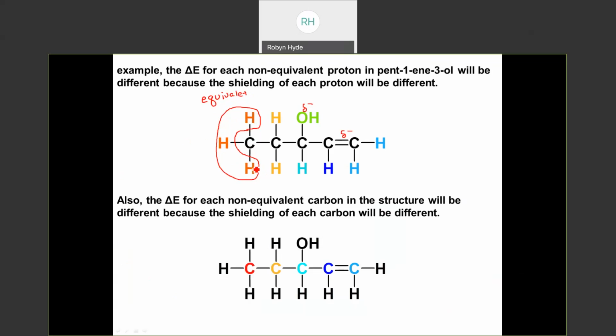So Abby, this is maybe getting at your question a little bit more in detail, I think, where you were going. So these three protons are considered equivalent. So all three of them are bonded to the same carbon. And that carbon is 2 away from an alcohol, 3 away from a double bond. They're in the same environment. They are the same, so we call them equivalent. So we have 3 very shielded equivalent protons.